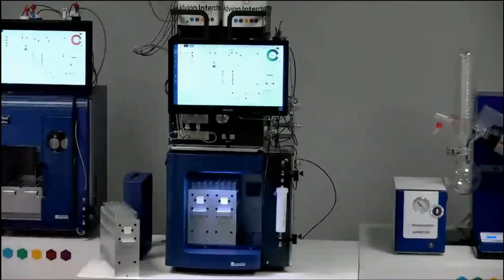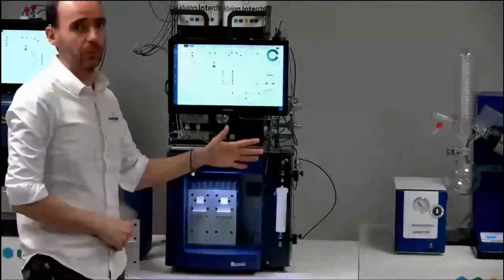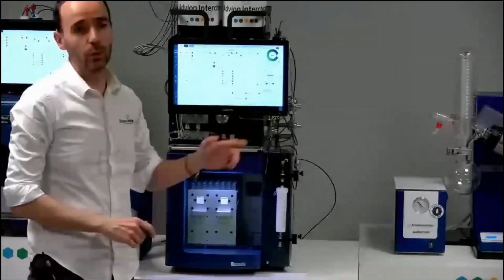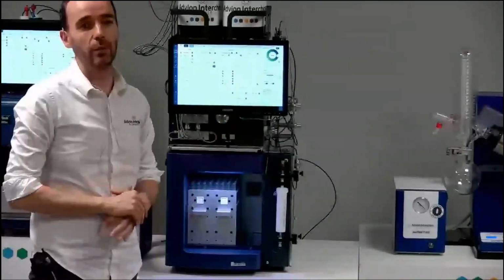Can you control additional external valves? No, it's not possible. You have two valves on the system. One is the repartition valve to choose between the columns, and the second one is the injection valve. But you can't add any other valve on the system.